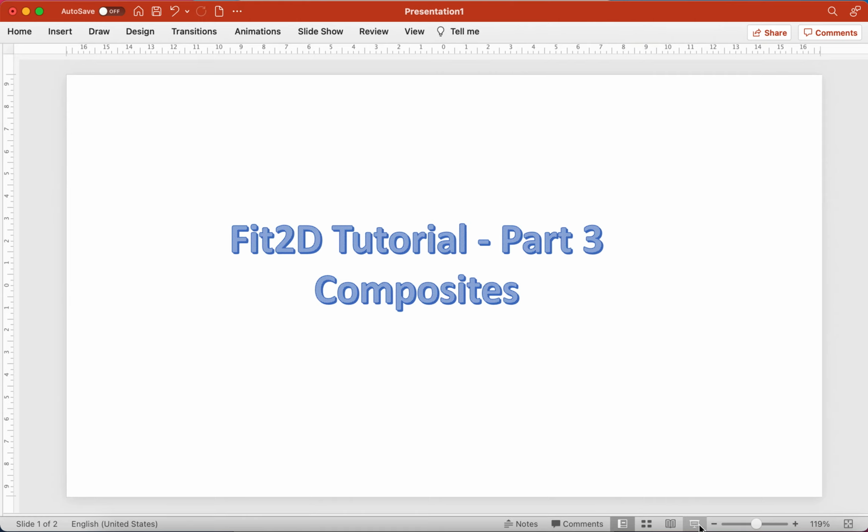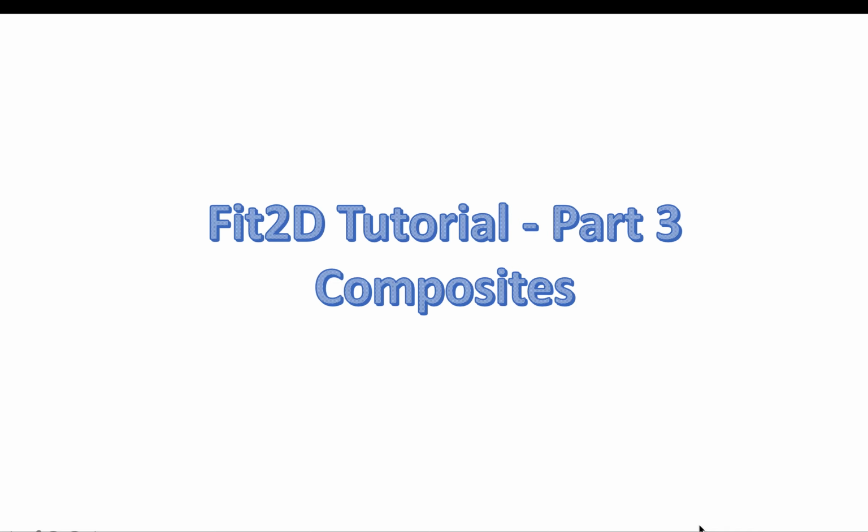Welcome to the third part of this Fit2D tutorial. In this part, we will be explaining how to create composite maps. Composite maps is a way to visualize the data collected from an area scan.